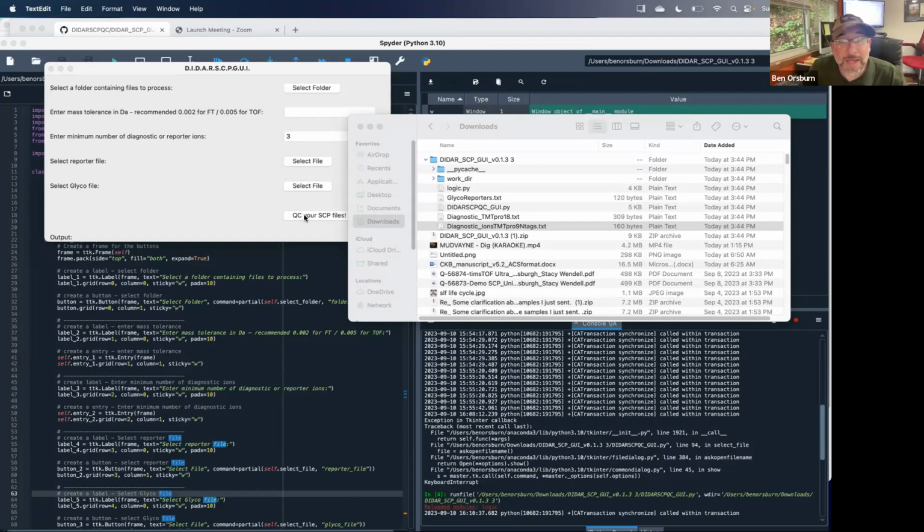If you're not running through the IDE, there's probably nothing you're going to see running in the background. What we do know for sure is that this runs much faster on a solid state drive. Your diagnostic text file that contains all your QC data will be inputted into that file.